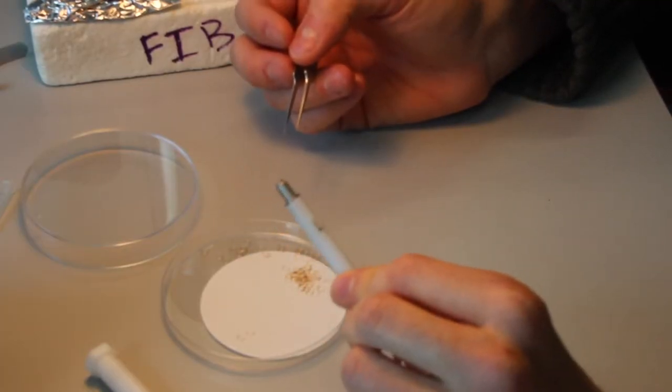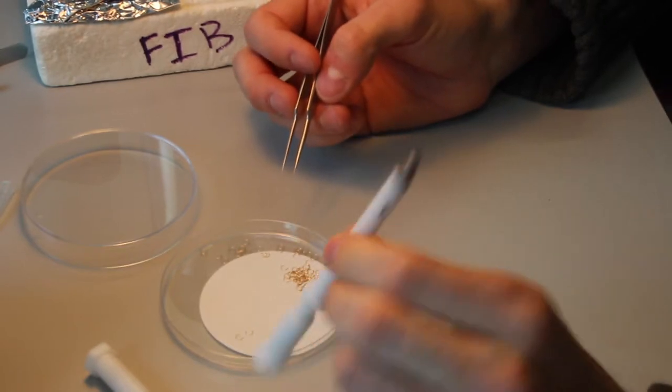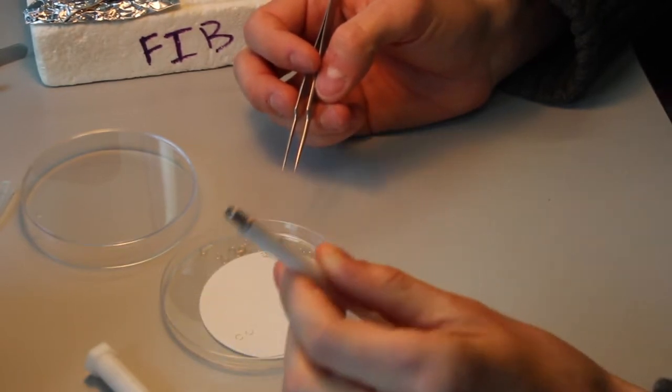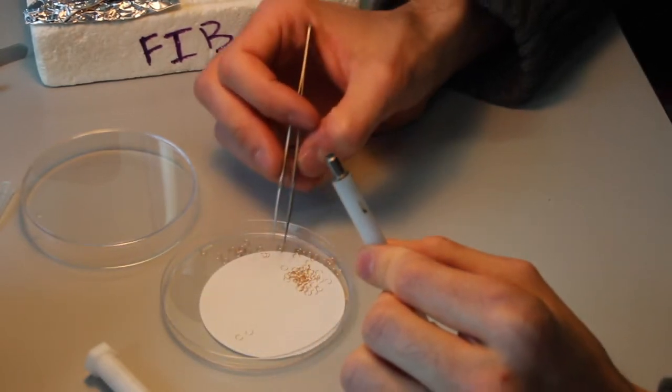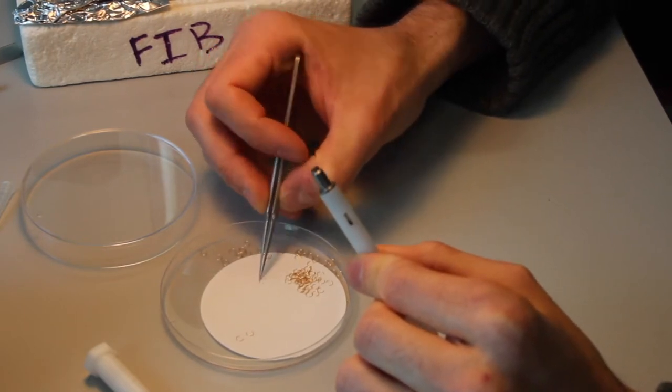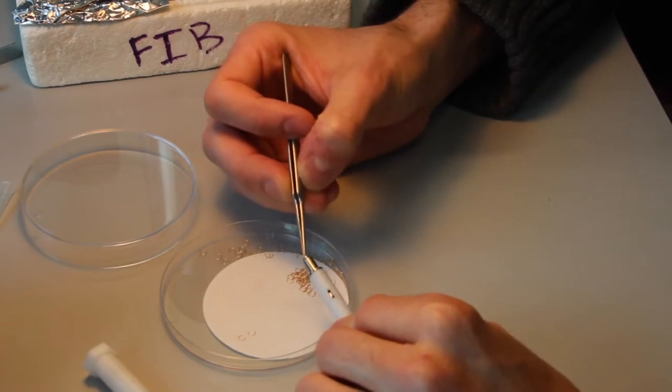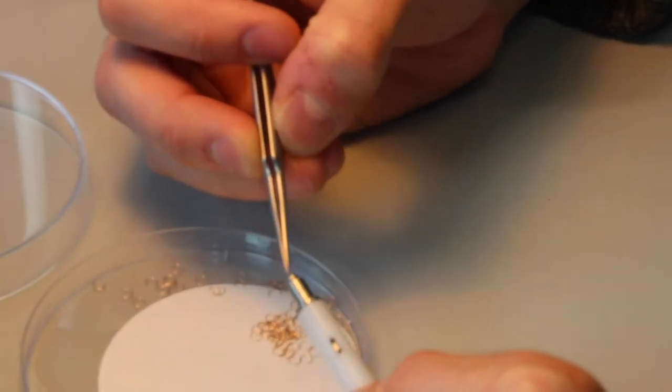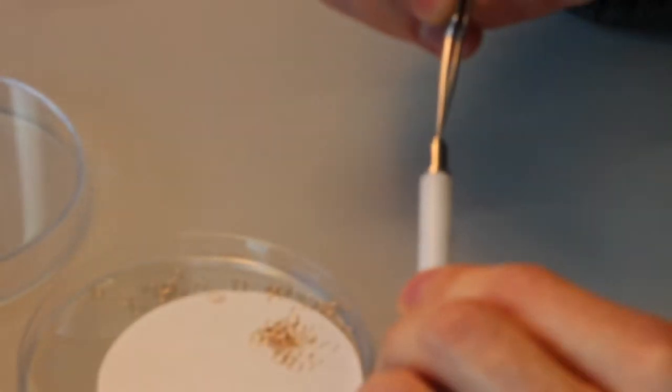This is the prep and loading video for the CryoFib SEM. We're using a clipping tool to clip grids, just as at the Cryos. With your tweezer, take one of the clip rings and insert that onto the end of the clipping tool and flatten that out.